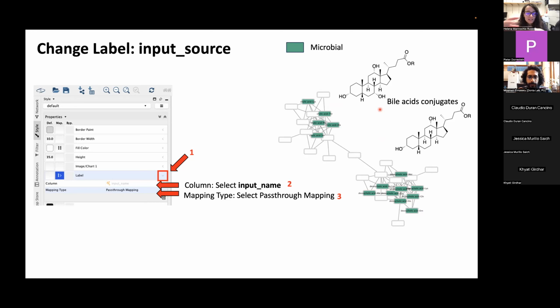So this type of mapping is very powerful, because right now we can see all these microbial modifications. What we can do as well, and we're not going to explore that here right now, is try to propagate this annotation based on the difference of the precursor ions between two nodes. So then you would need to manually inspect what could be here, if it has an annotation.